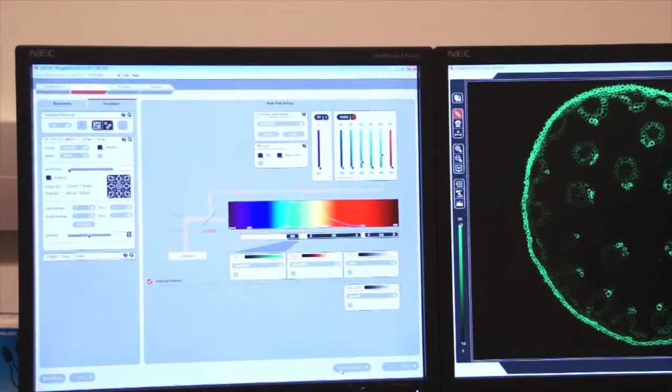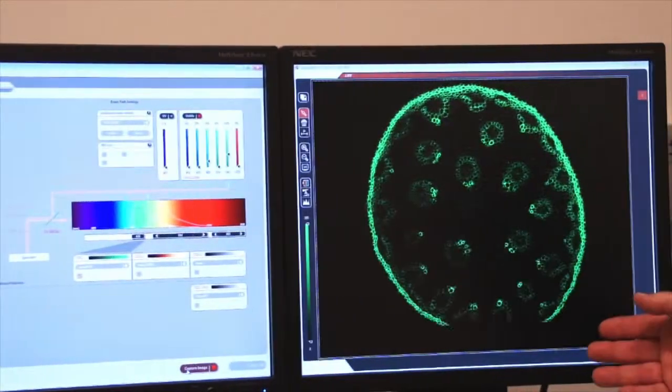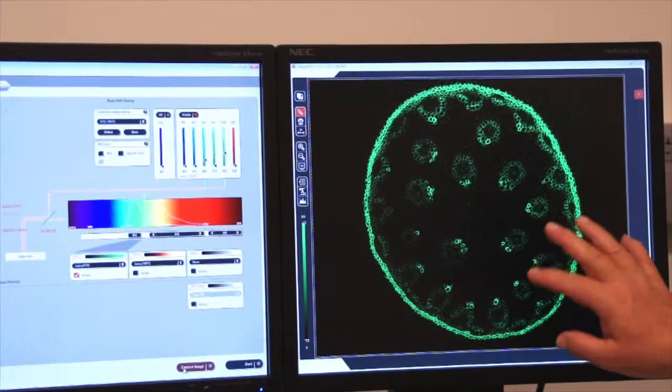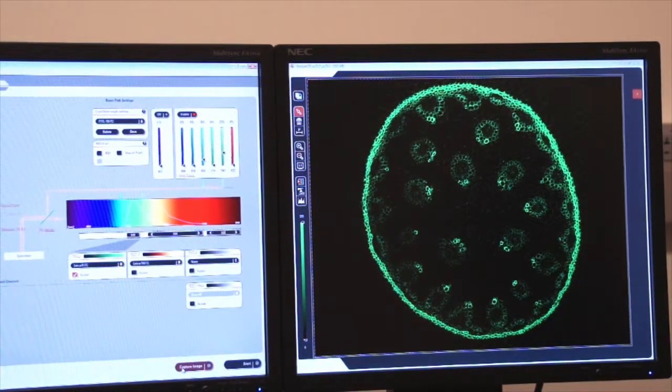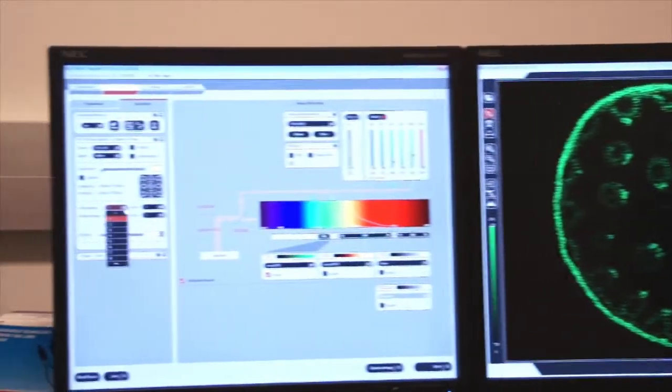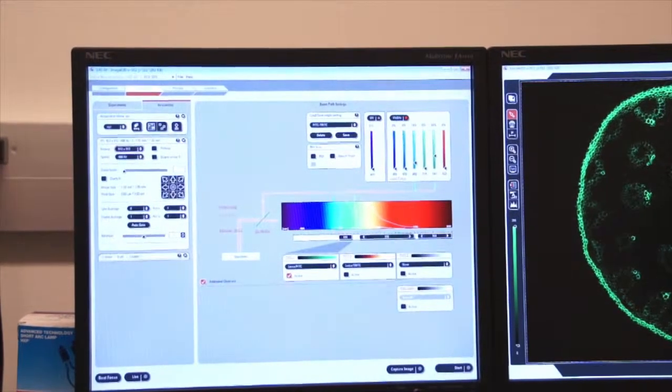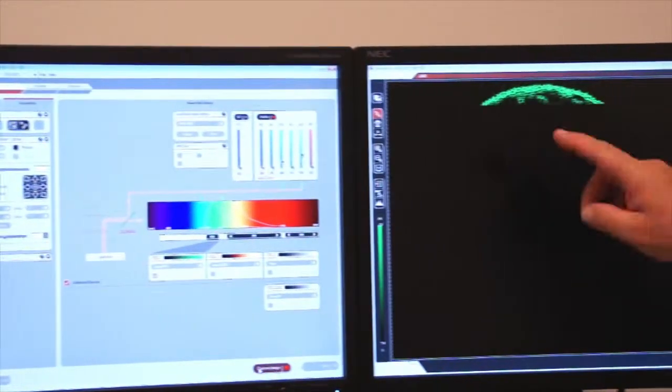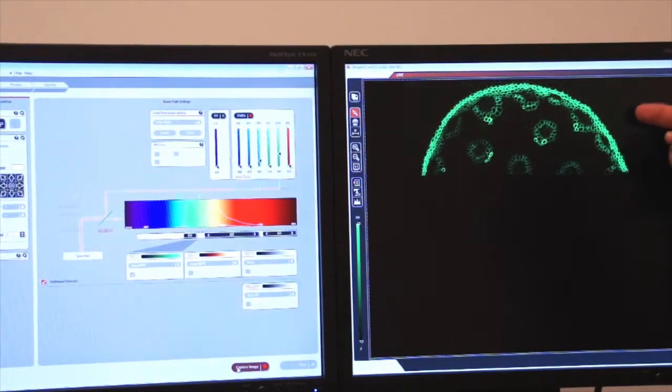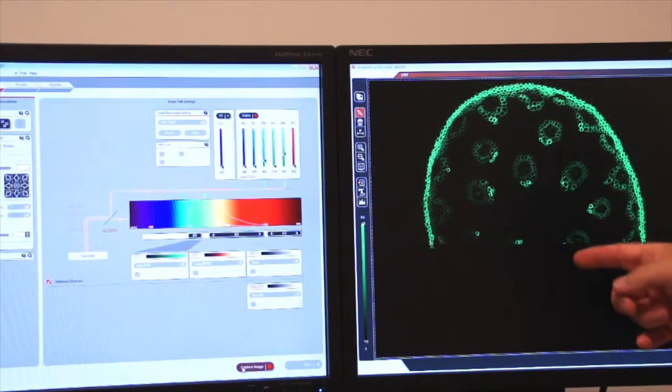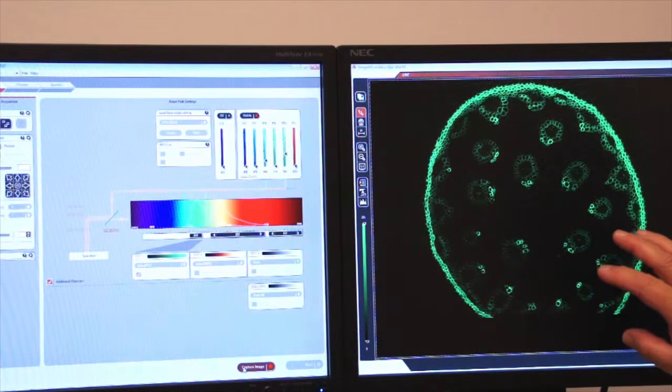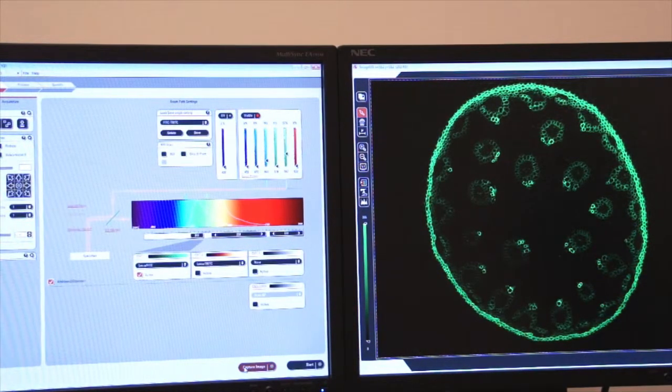We'll do capture image. You see how fast the image is collected, but it's a grainy image, low resolution. So if I select again, six line averages, I've told the system to capture me an image, but average out those lines and you can see a lot of that background noise goes away. I get a nice high resolution image using line average.